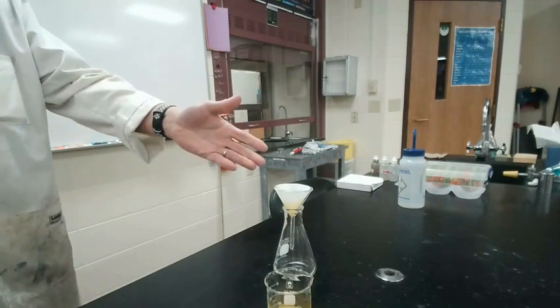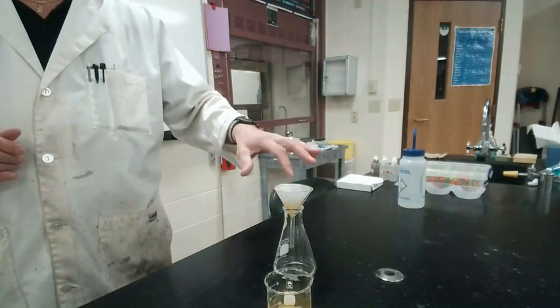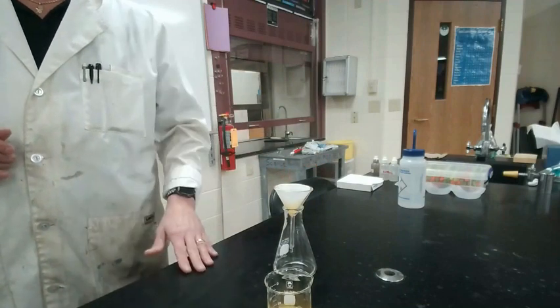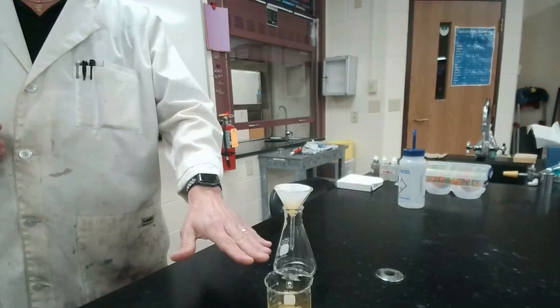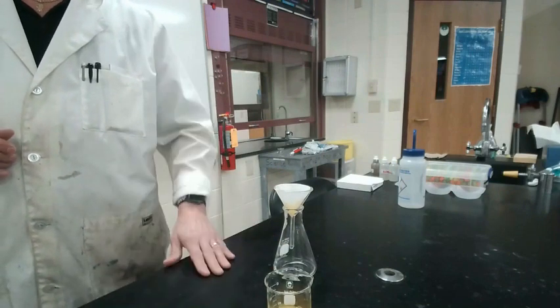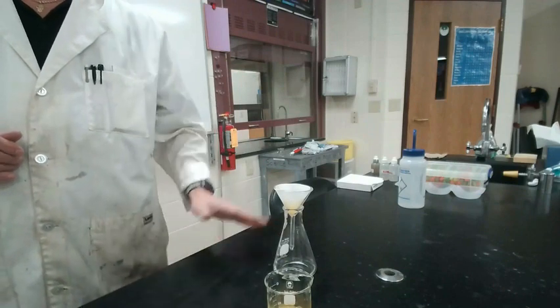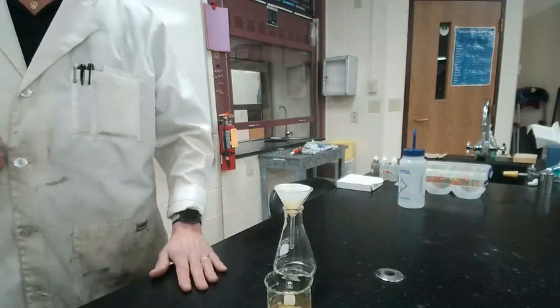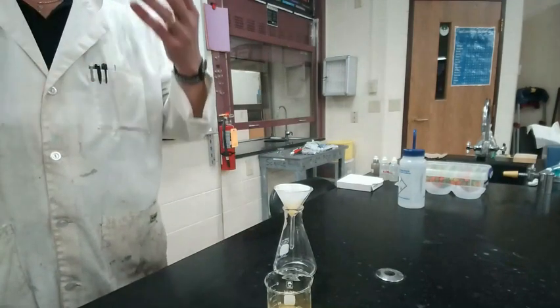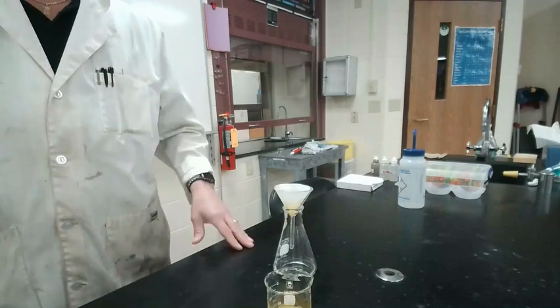Now again, the filter paper, I'm still starting to catch the silver or the yellow precipitate in here. Why? Because I need that. That's what I'm trying to measure. So in the end, I'm going to have some left in the bottom of this beaker, and I'm going to have some in here. When I've got most of the water out of here, and after I've rinsed this a few times, I'm going to throw the filter paper in with the beaker. I'm going to put it in a drying oven overnight, and I will show you what the residue looks like tomorrow after it has dried overnight.